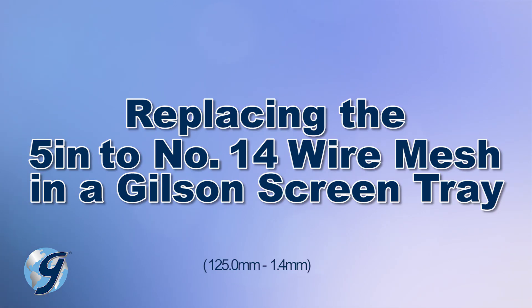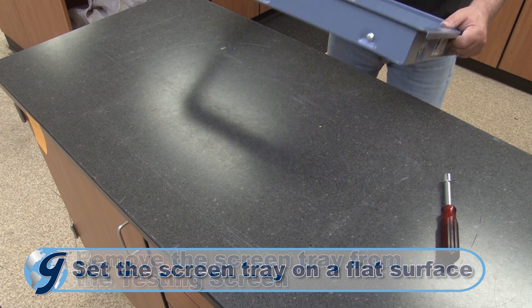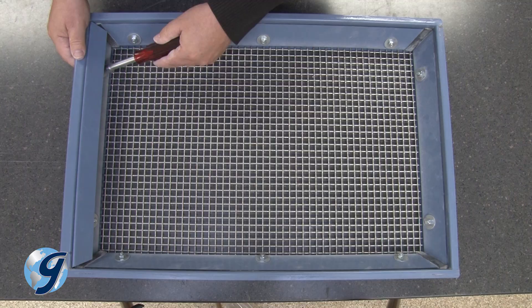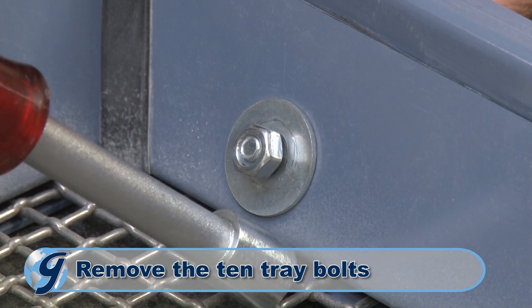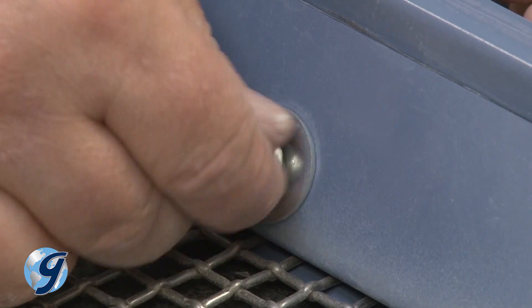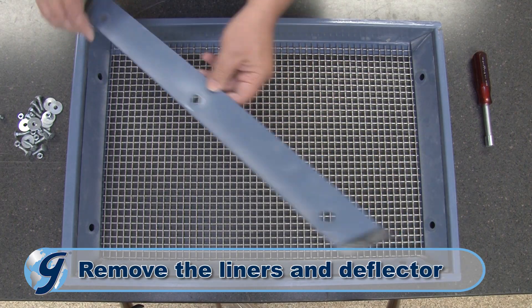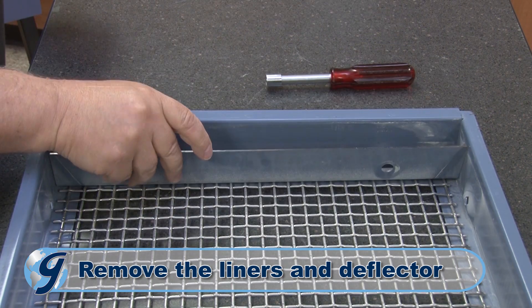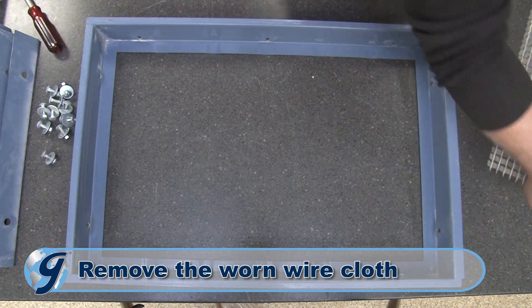To replace the wire cloth in your Gilson screen tray, you first remove the screen tray from the testing screen and place it on a flat surface. Now remove the 10 tray bolts securing the side and end liners holding the wire cloth within the screen tray. Next, remove the liners and the deflector, which is on the front end liner. Take the worn wire cloth out of the screen tray and set aside.